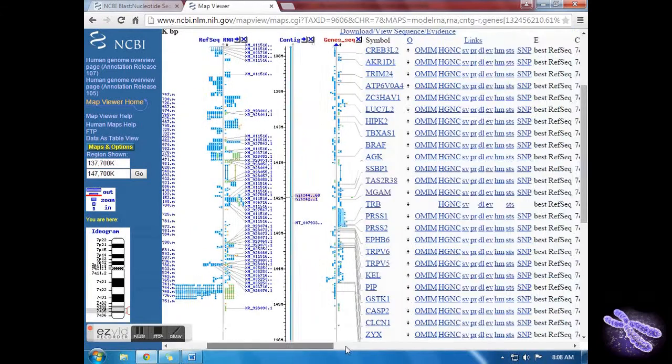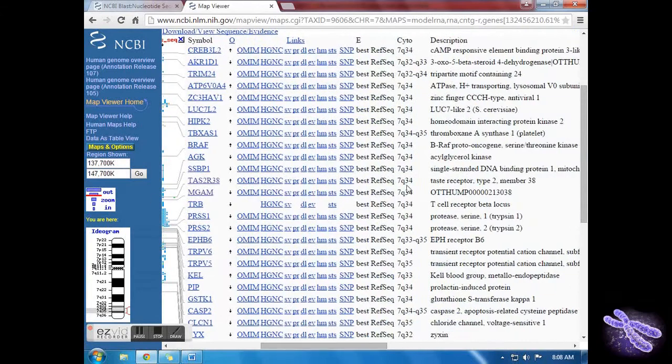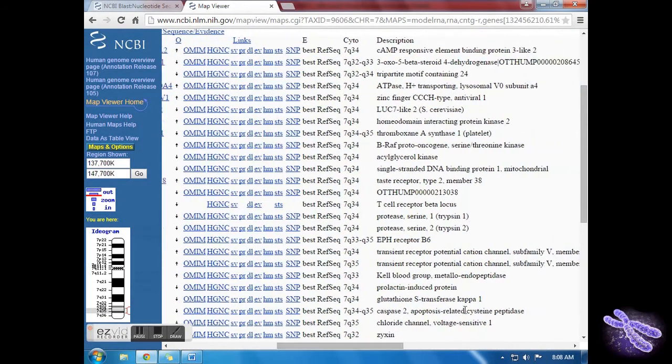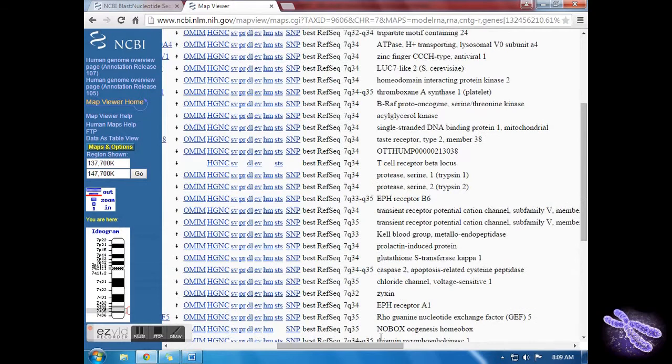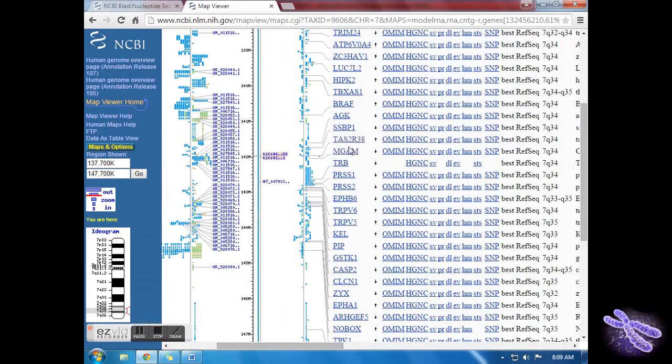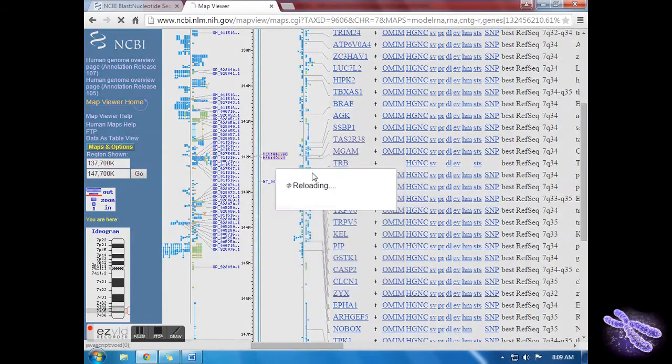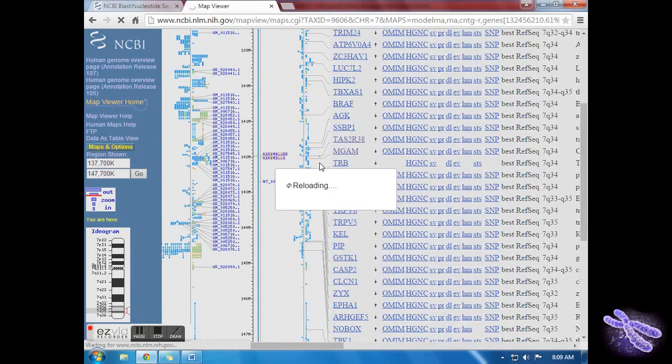On the right hand side, it will give you a description of what each gene codes for. Once you find the genes next to TAS2R38 that also code for a TAS receptor, you may stop.